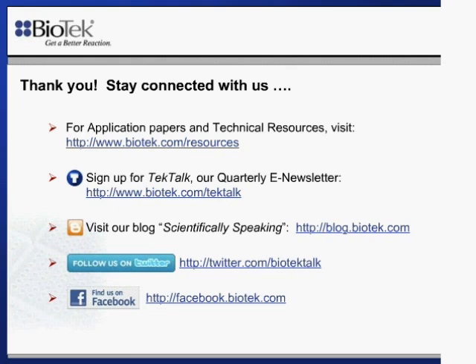And the black coating works significantly better than the white coating. And so if you're purchasing a new Take3 or Take3 Trio, those will come with black slides, which work fine for fluorescent type assays. And again, we have several application notes available on the website where we've done work with fluorescence on the Take3 and microvolume.